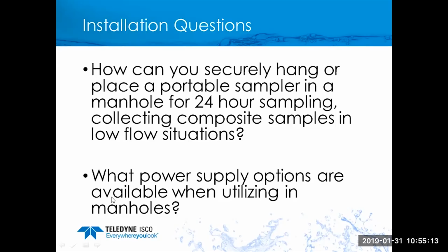A lead-acid battery has very good charge retention, whereas a NiCad will generally discharge at a rate of about 2% of charge voltage for 24 hours. So for regular sampling, the NiCad is probably a better choice. For stormwater sampling or something similar where we need standby power, the lead-acid is probably the best choice for us.